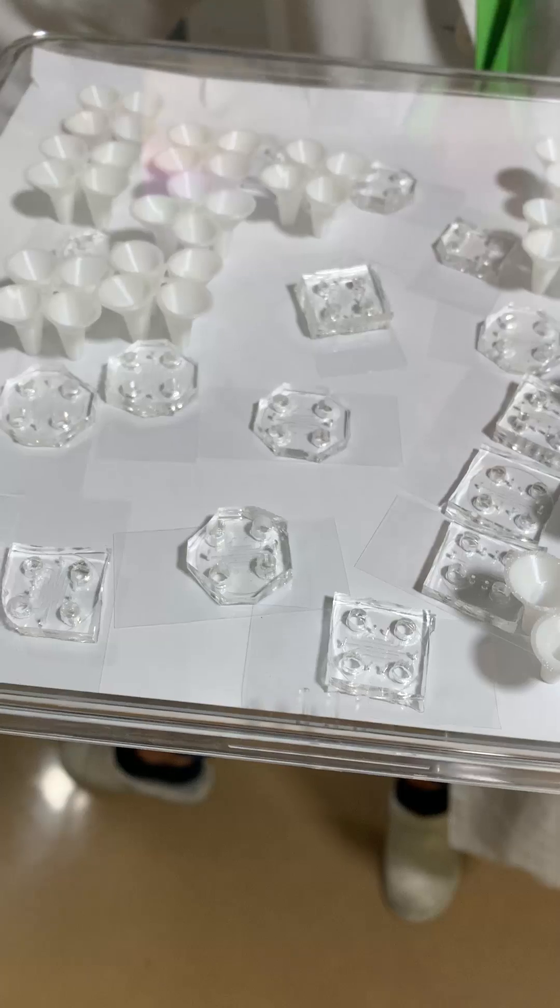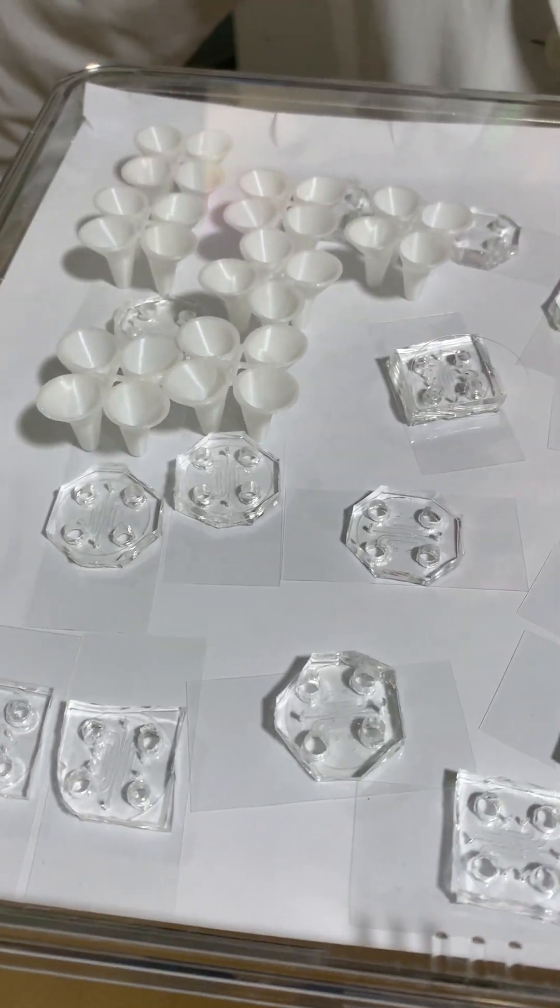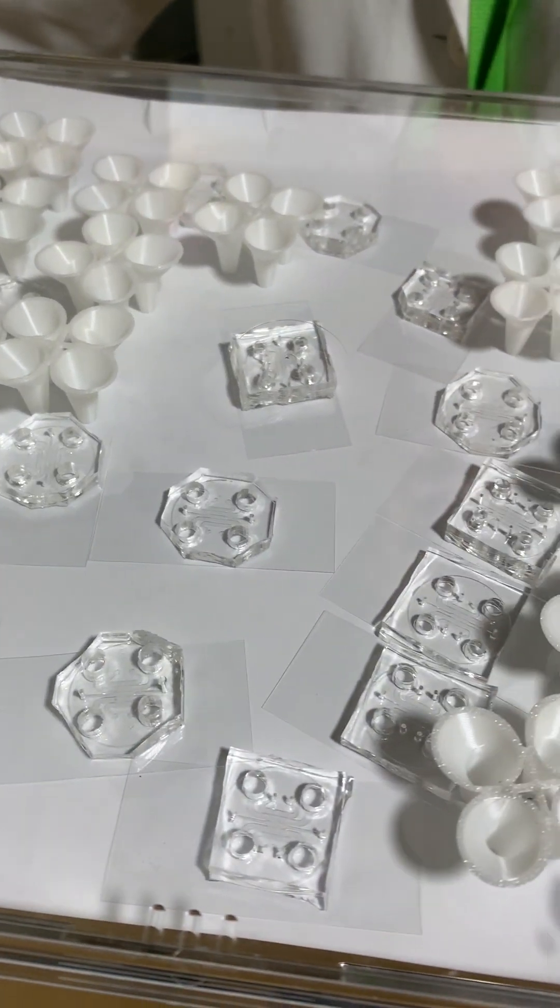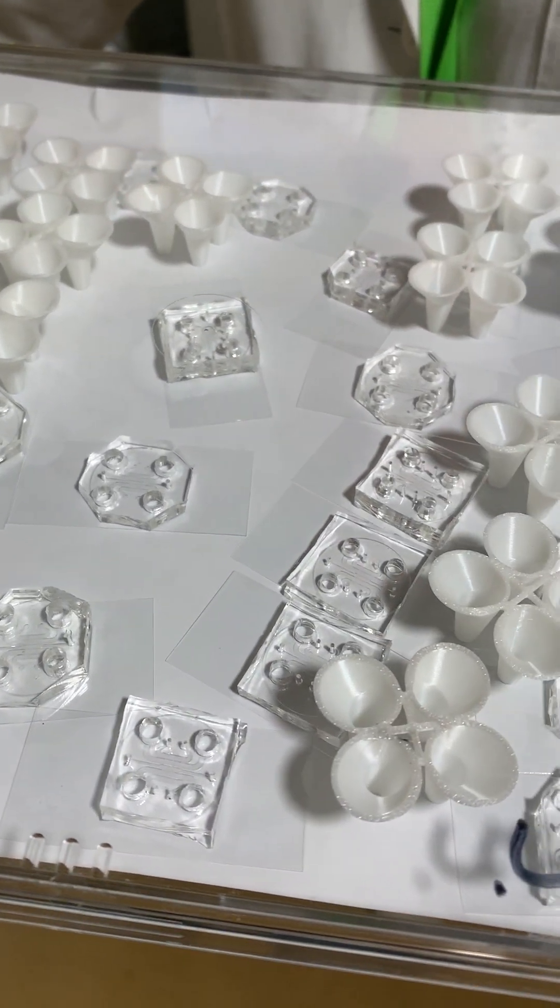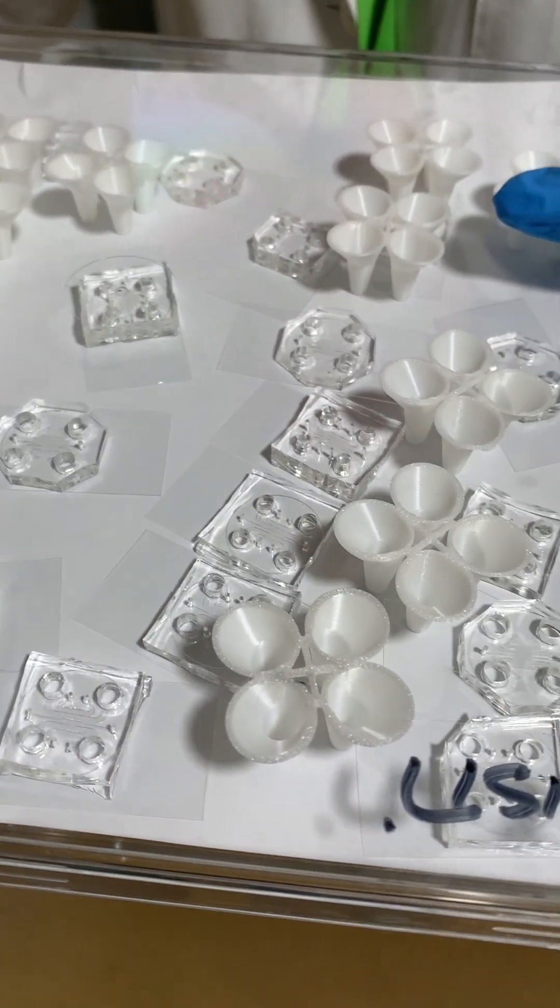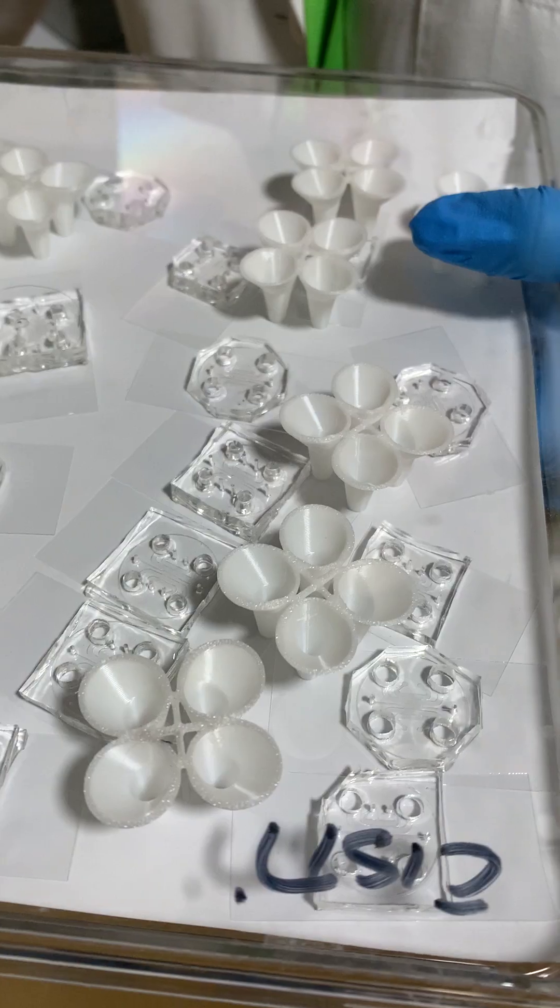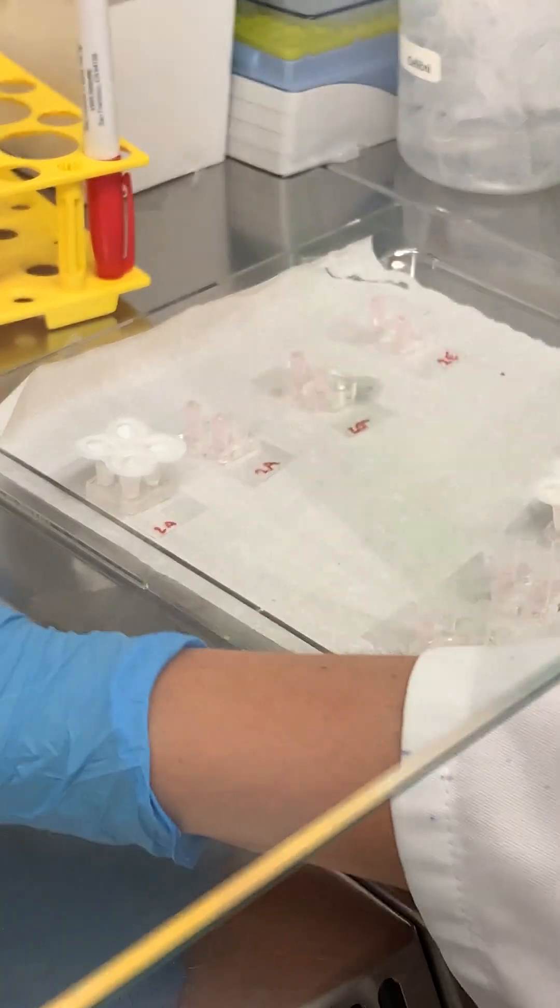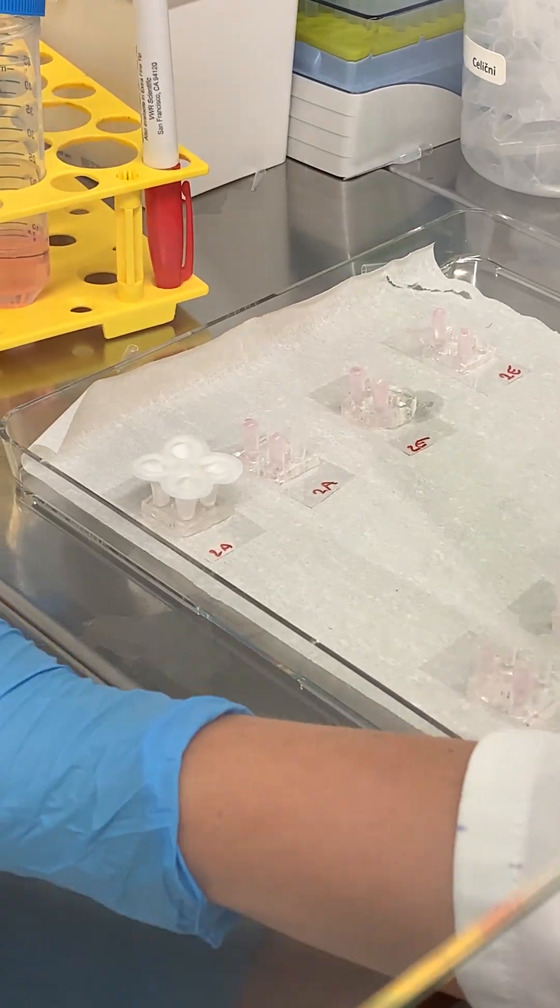The template and a special gel are then used to make the final chip. The chip is then placed on a cover glass, and the model with four connected cones is fitted on top of the chip.